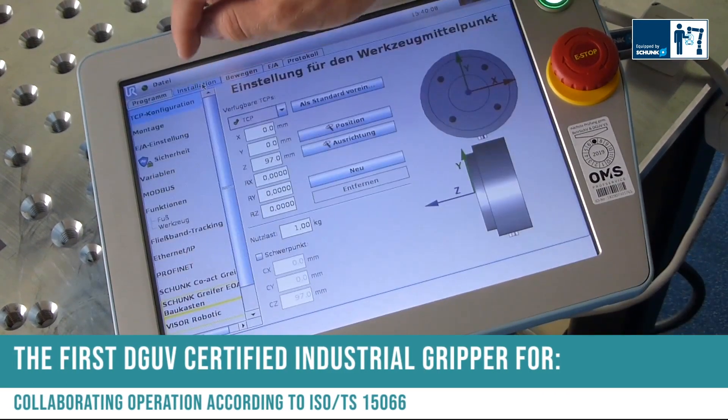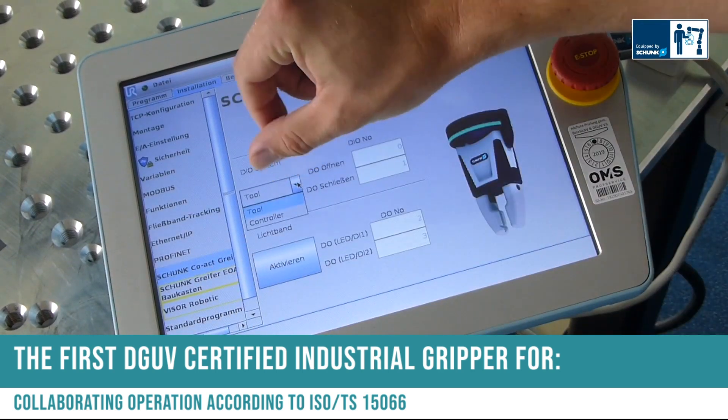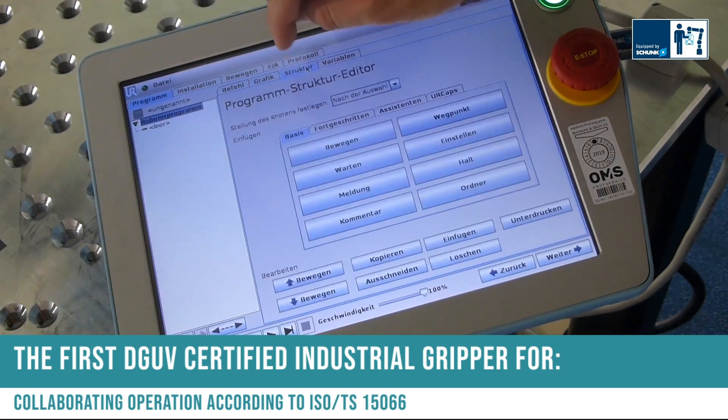The first DGUV certified industrial gripper for collaborating operation according to the ISO TS15066. Thank you so much.